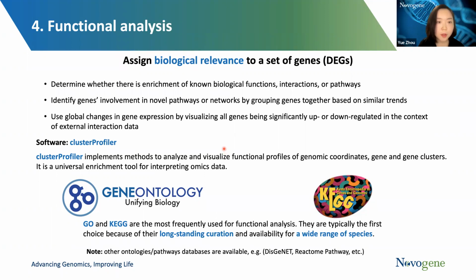It also uses global changes in gene expression by visualizing all genes being significantly up or downregulated in the context of external interaction data.